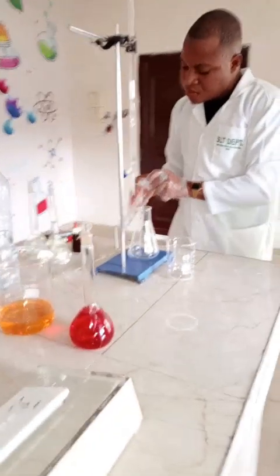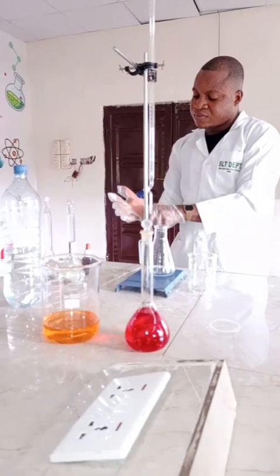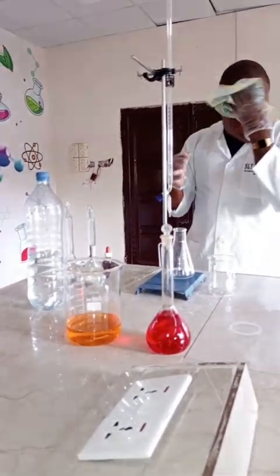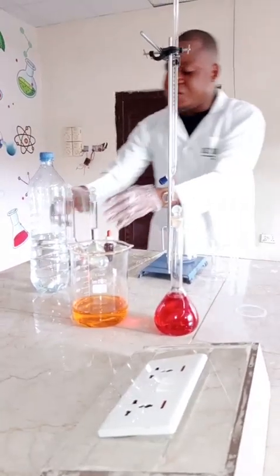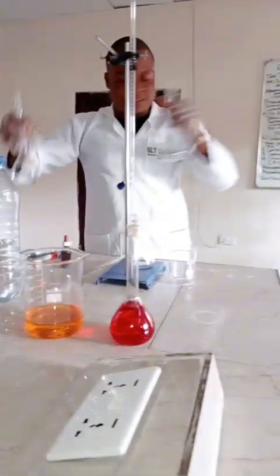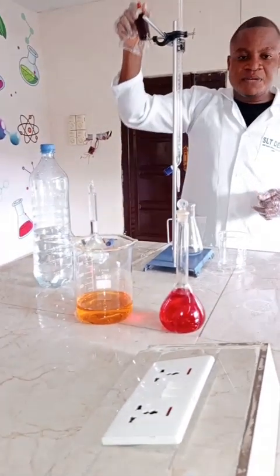Let's go back to our workbench. I've told you before, this is our HCl, our acid, this is our base, and our indicator, methyl red.